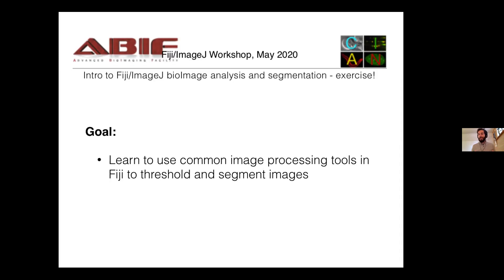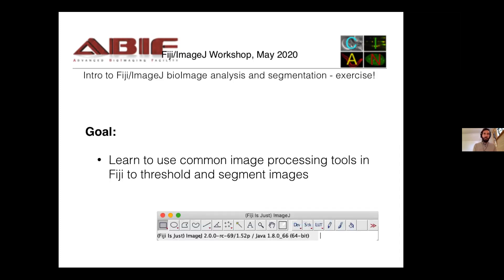The idea is to detect objects and get quantitative information from them. We'll be using the Fiji window. If you've never used Fiji before, we're going to walk you through it. If you have, you'll get a chance to see different ways of using it and perhaps compare with what you're already doing.